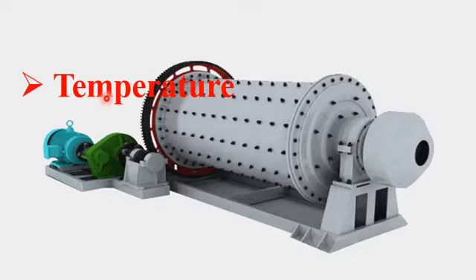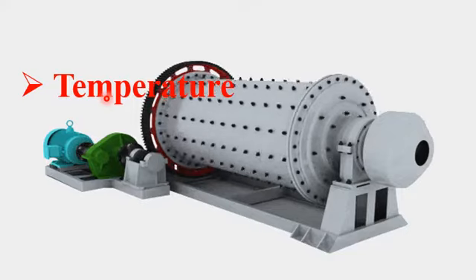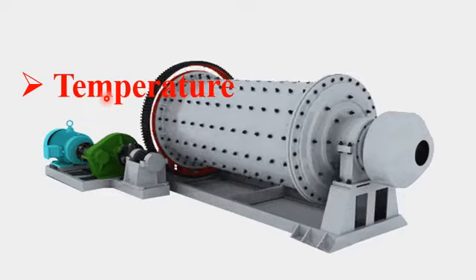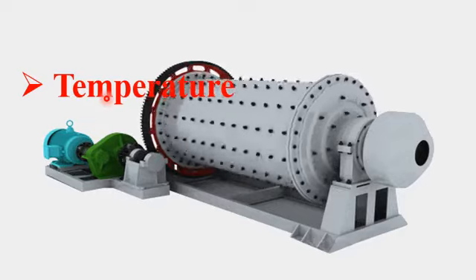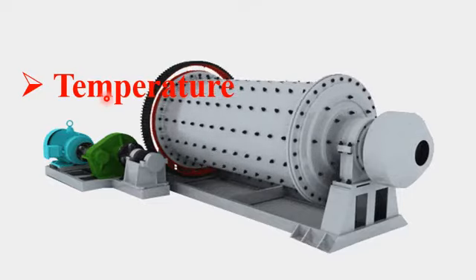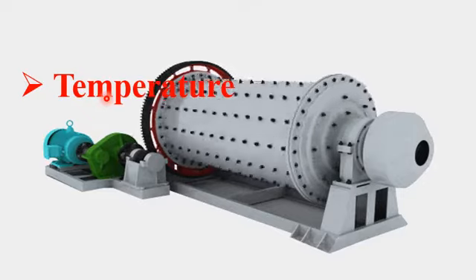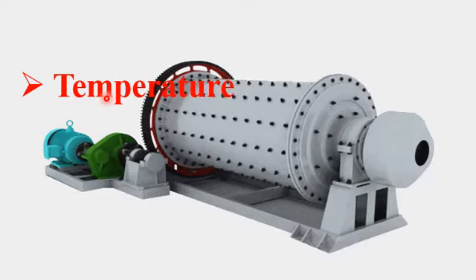So temperature is considered first inside the ball milling apparatus. Number two, before the milling of the bulk material, and after milling, or after getting the milled nanoparticle, and the temperature after the milled nanoparticle.